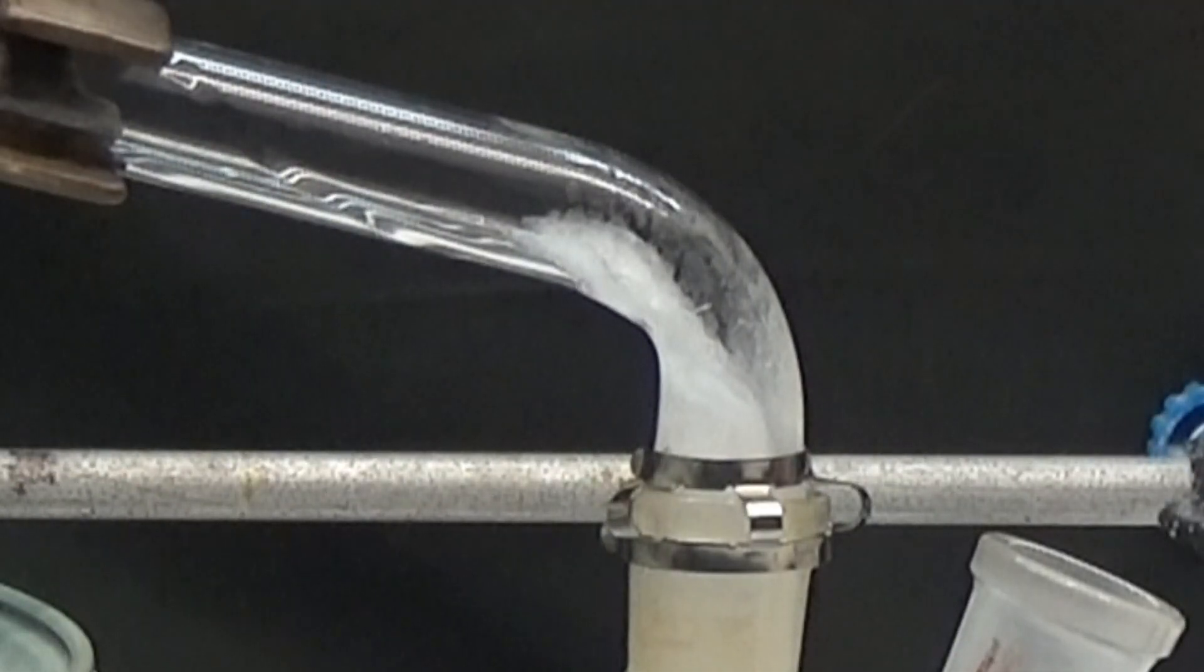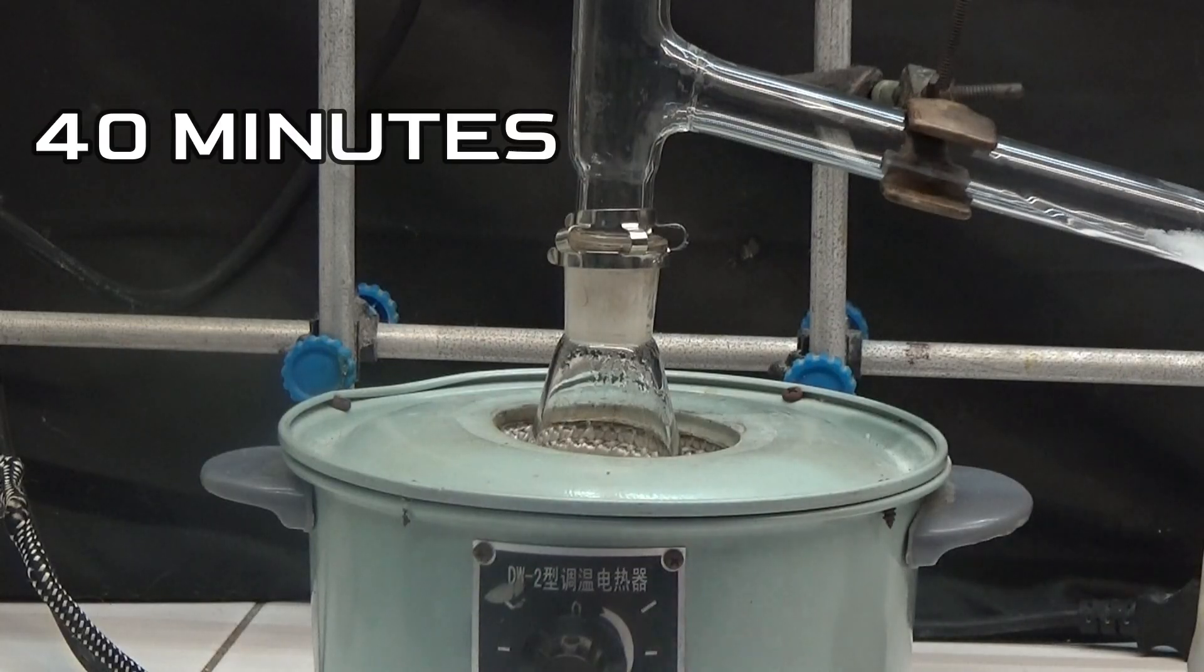We must be careful not to obstruct the tube, as this could cause overpressure and the system could explode. We leave it heating for about 40 minutes in total and stop the heat.